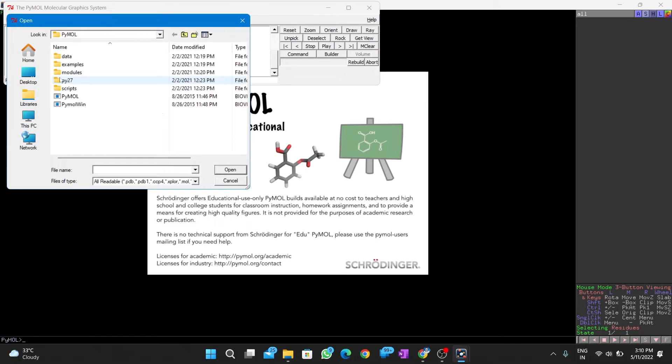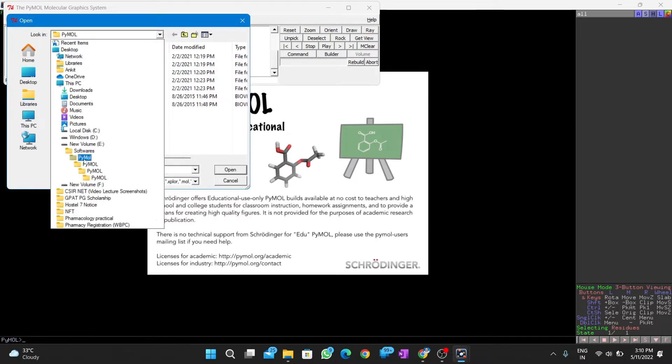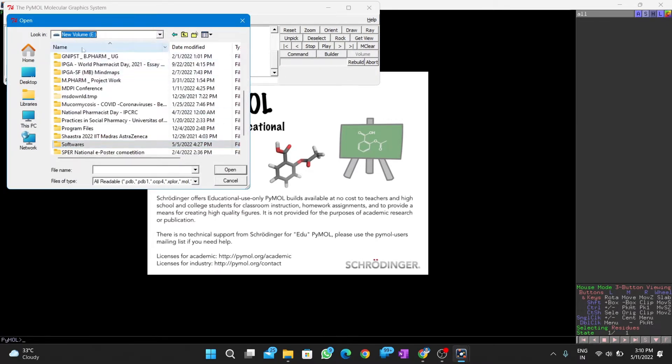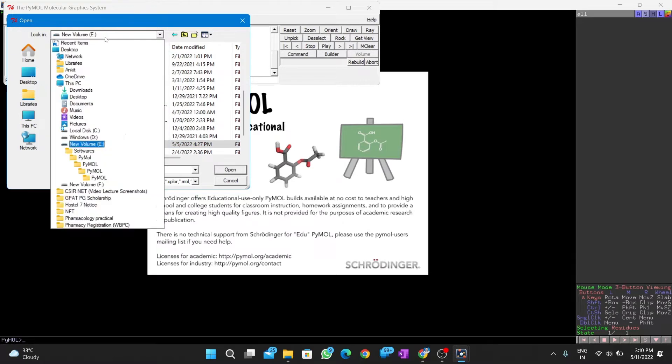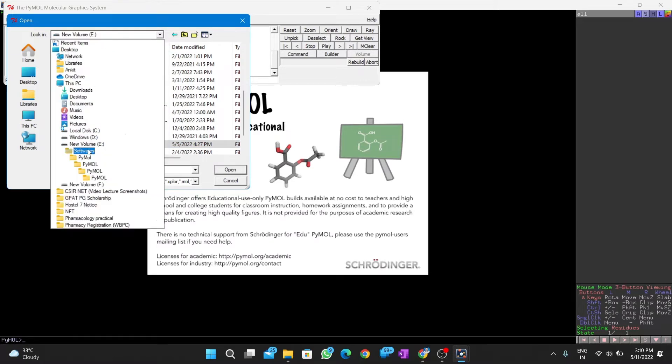At first, we open the receptor. Here we use the 6lu7 receptor in PDBQT format.